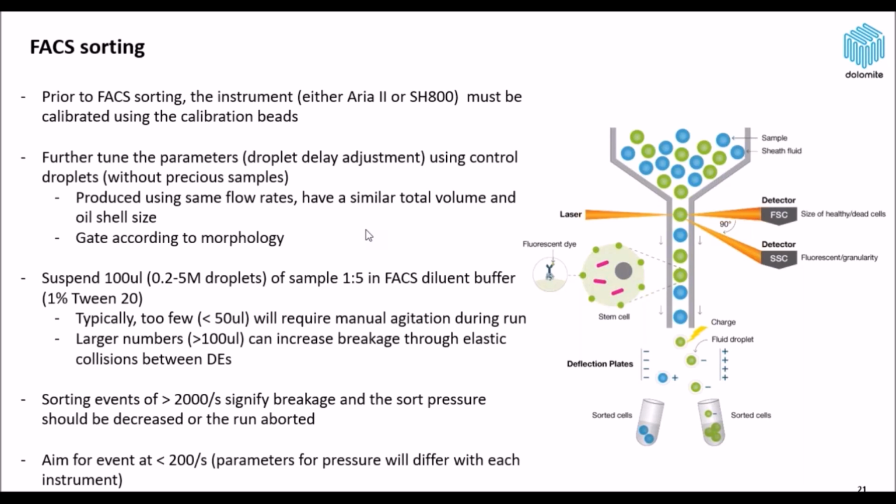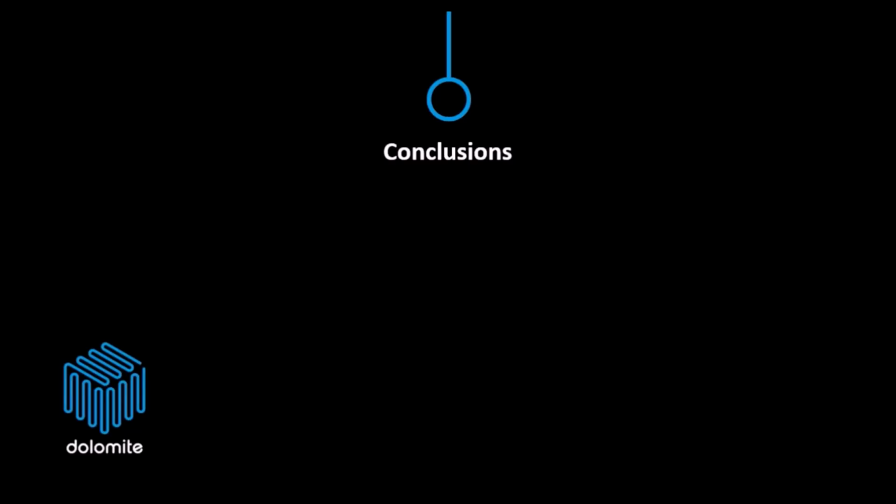So with the ARIA and the Sony, there are some differences, but that's something that you can work out with an engineer from each of those instruments. But usually, once you have the parameters in place, they are quite similar in how they perform. So that's also worth noting. So those are just some of the key points that you want to keep in mind.